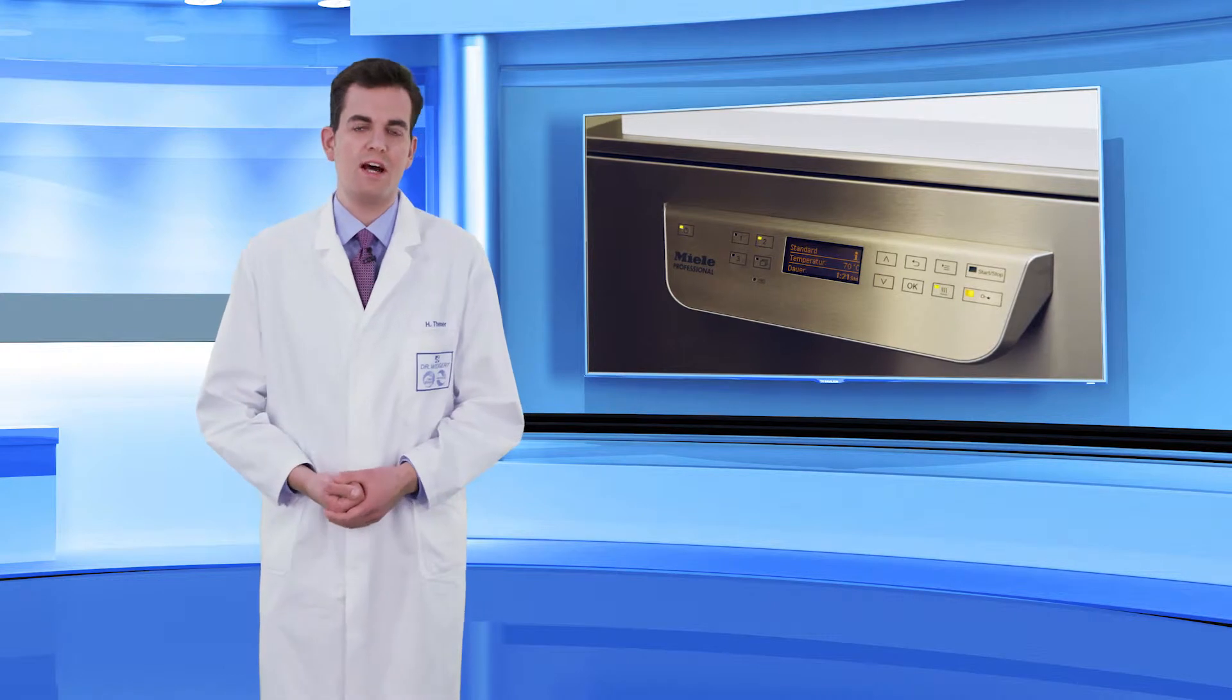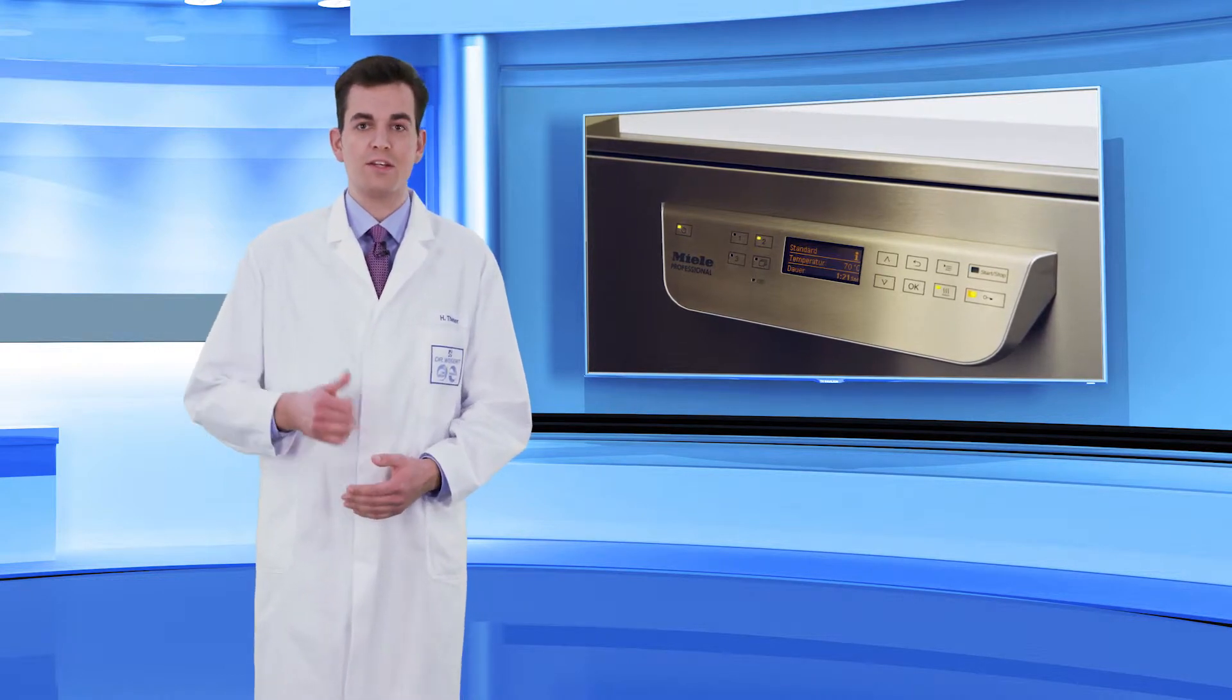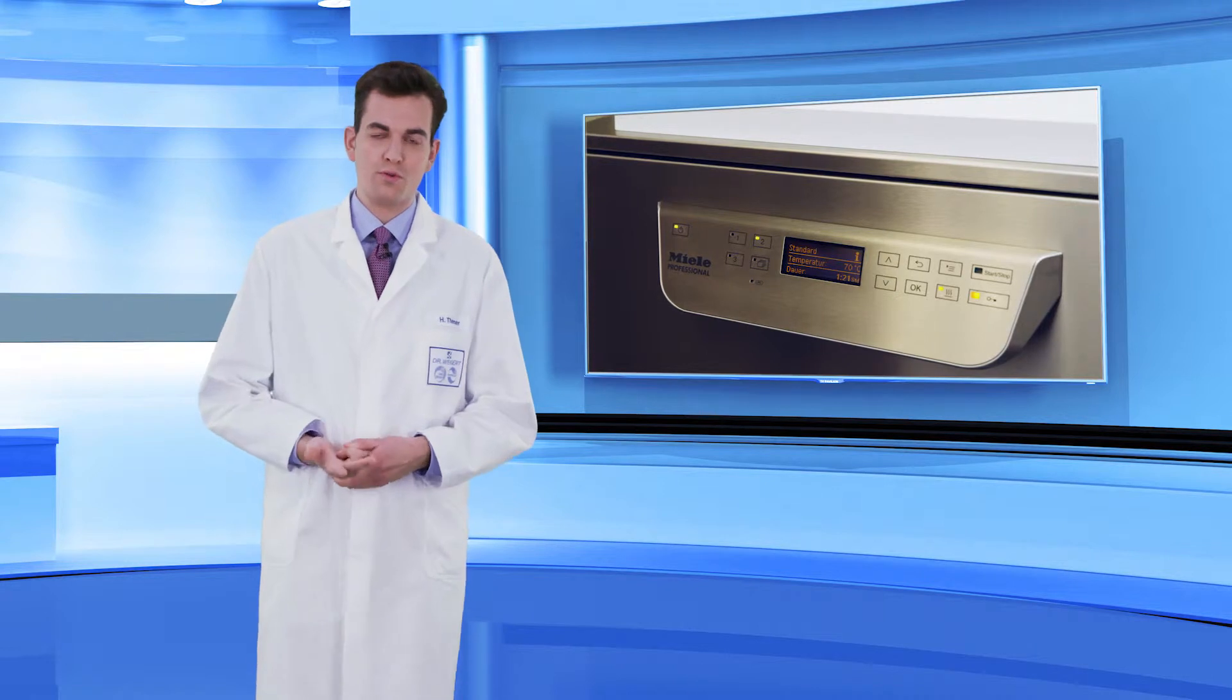Automated cleaning is an effective method of reprocessing that can be standardized, validated, and documented.